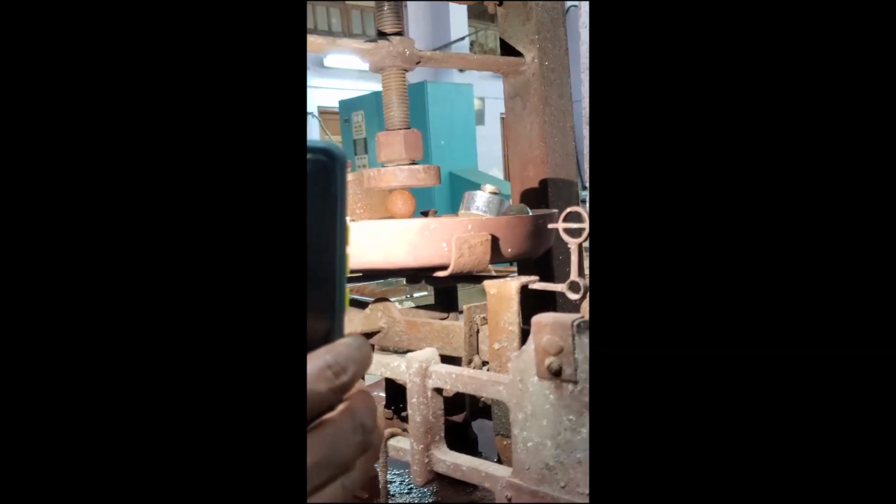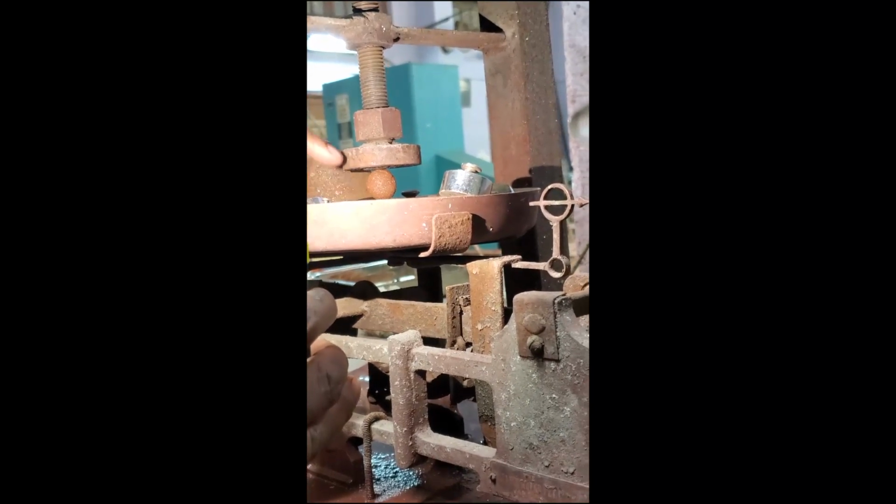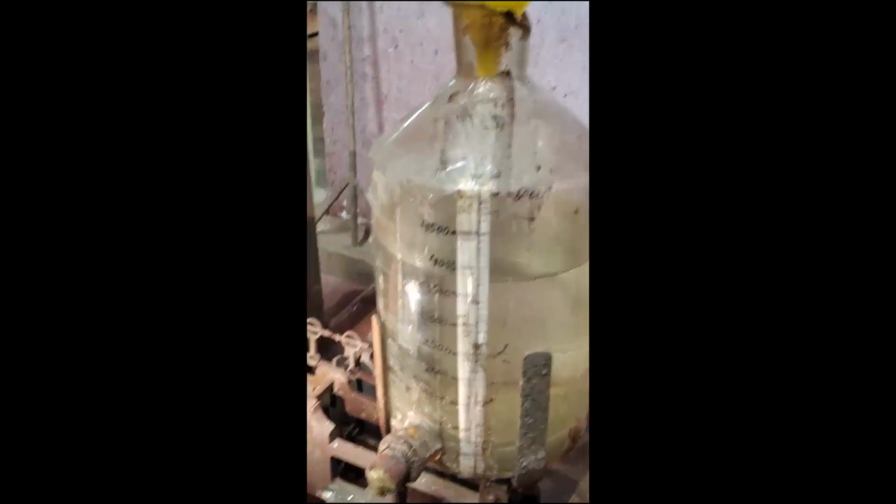Now this is the third pellet. Here also you can see we made it equal. Left side and right side, both ends are now equal. Here what is the condition? We kept the green pellet between the bottom platform and the top platform. So here the pellet is in between the two plates. With the help of this head, we touched the pellet. Balances are equal.